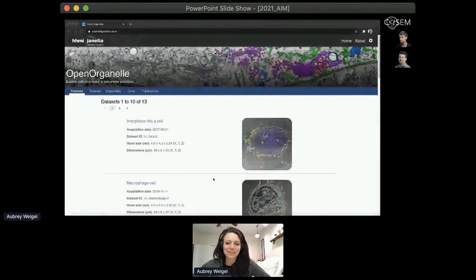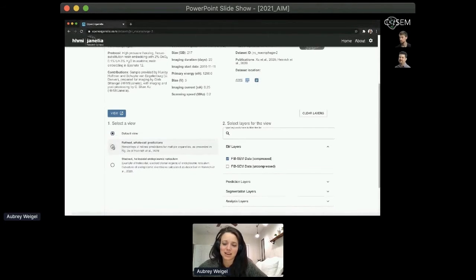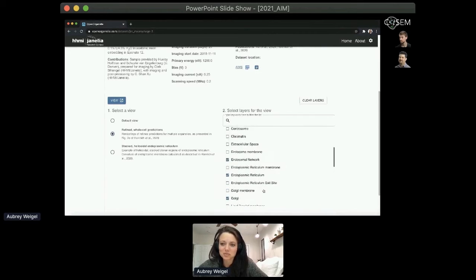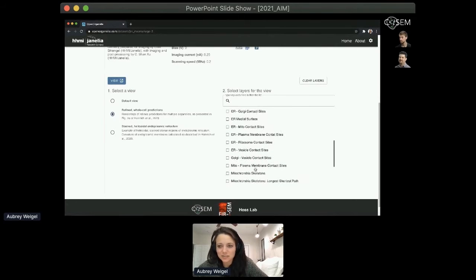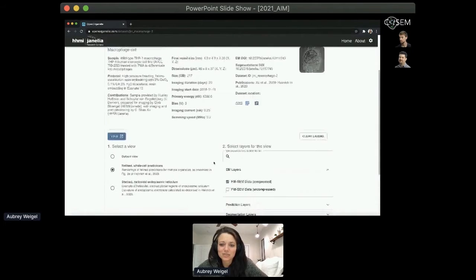So most importantly, all of this work is being made publicly available through our open access portal, OpenOrganelle, with the data hosted by AWS. Here, together with the HHMI Janelia FIB-SEM technology group, we provide a browsable and soon-to-be queryable interface for people to explore these EM datasets and the accompanying segmentations. You can browse pre-made views, or you can customize your views based on what you want to see. You can then explore the data online using Neuroglancer.